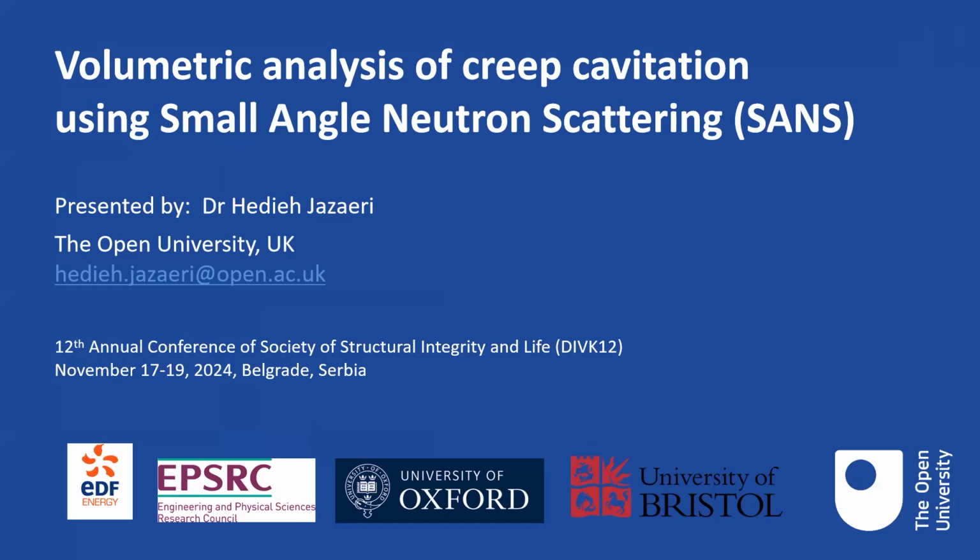We're looking at the volumetric analysis of creep cavities using small angle neutron scattering. This has been collaborative work, supported by EPSRC, and also in collaboration with the University of Oxford and Bristol University.